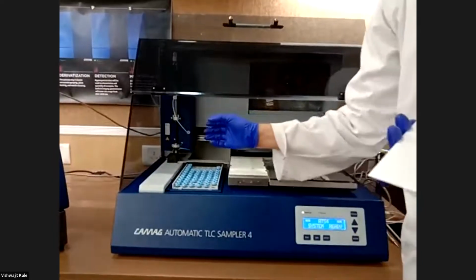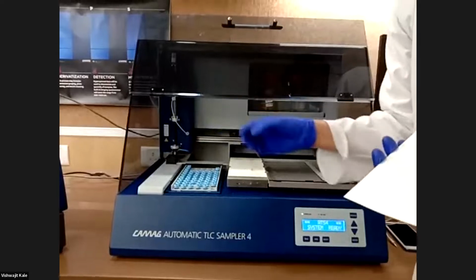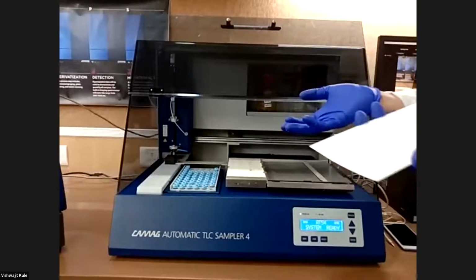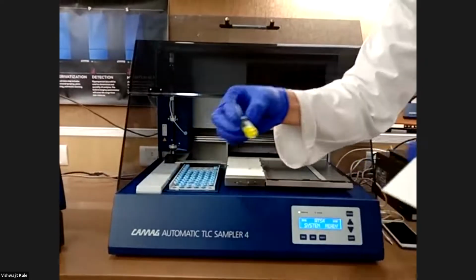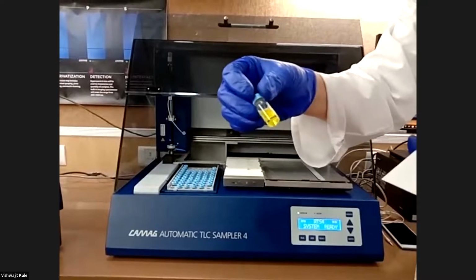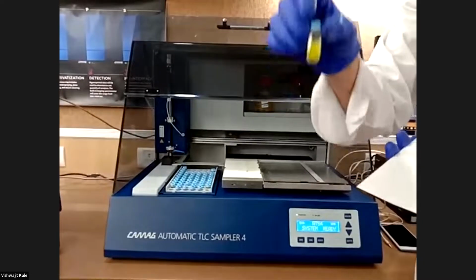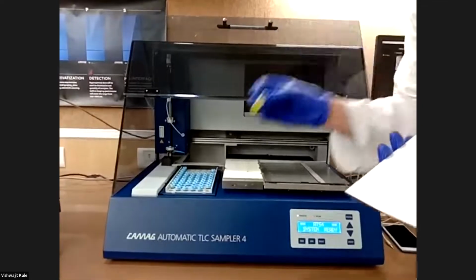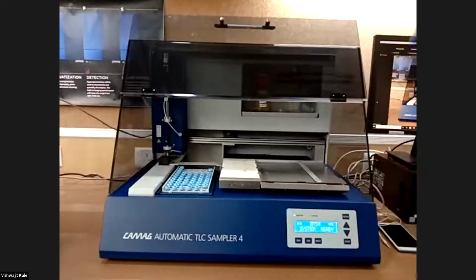It is possible that this syringe will get clogged because of turbidity or particles. So during sample preparation, prepare your sample in such a way that it is a clear, transparent liquid solution, whether colorless or colorful, it doesn't matter, but it should be clear without suspension, without turbidity and particles. For that, we do centrifugation or filtration.